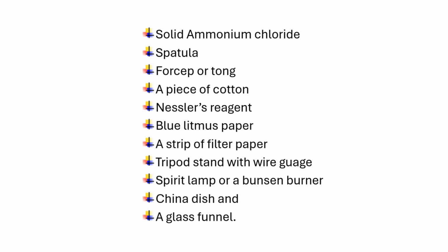Materials required: solid ammonium chloride, spatula, forceps or tongs, a piece of cotton, Nessler's reagent, blue litmus paper, a strip of filter paper, tripod stand with wire gauze, spirit lamp or a Bunsen burner, china dish, and a glass funnel.